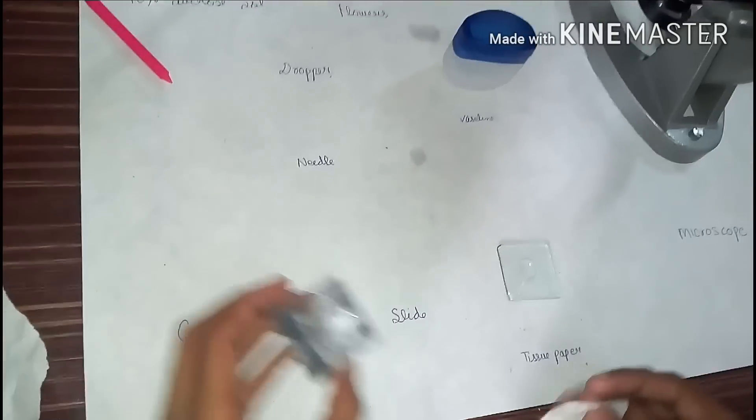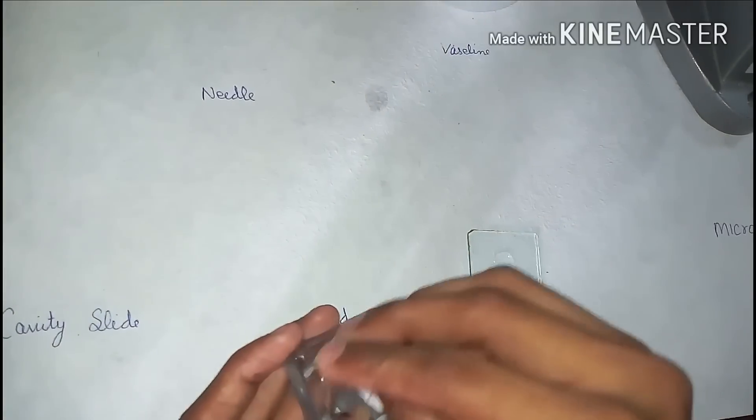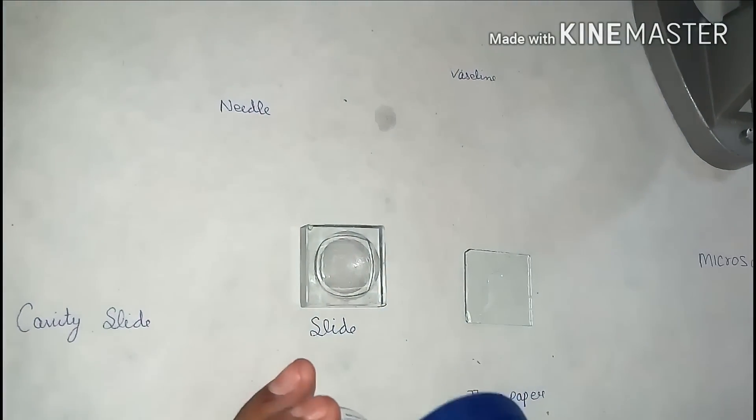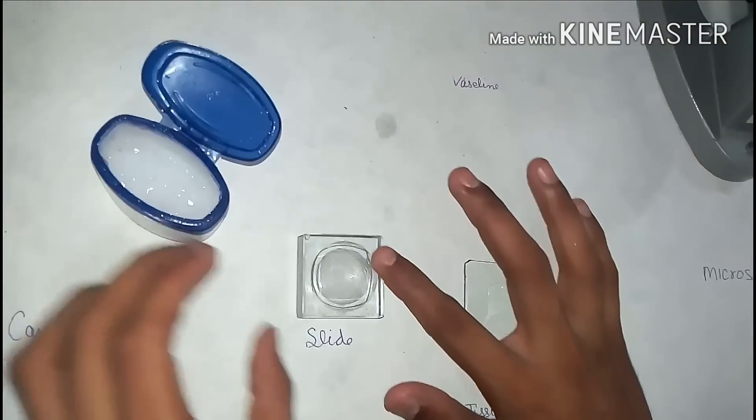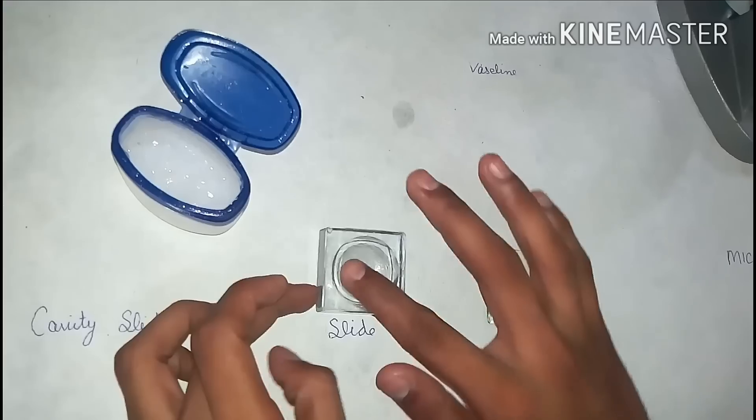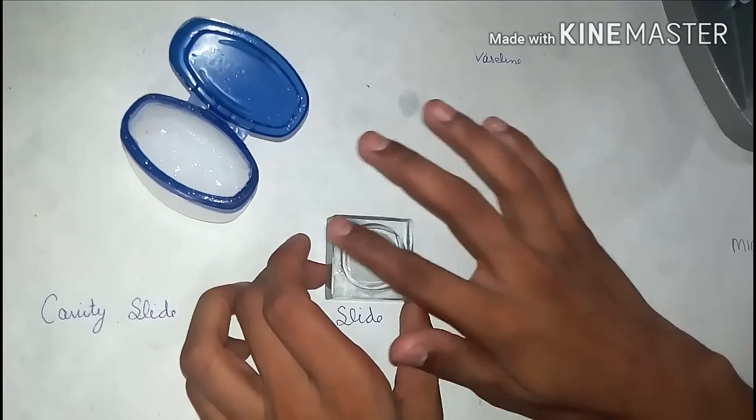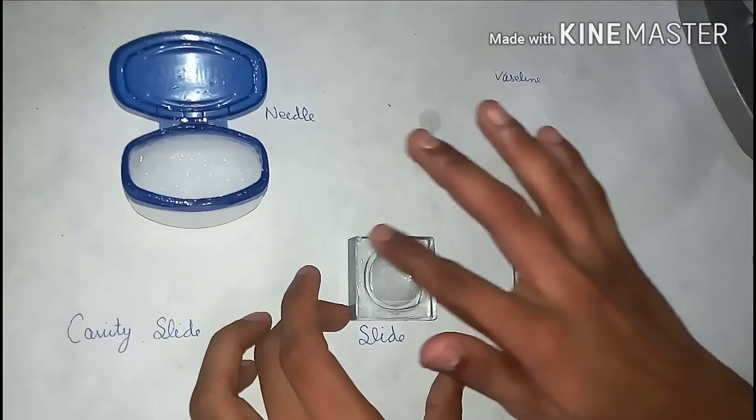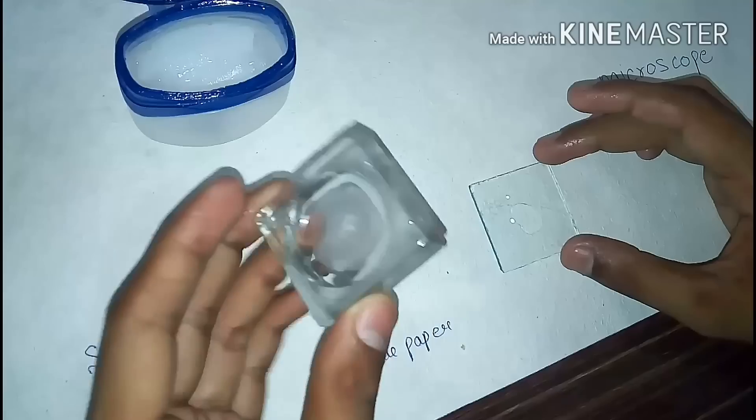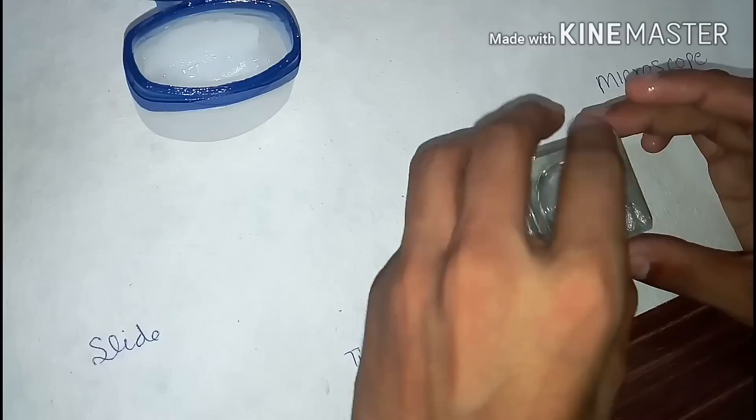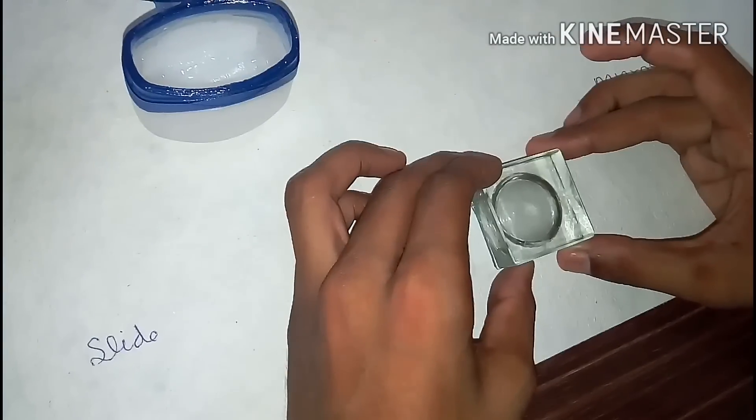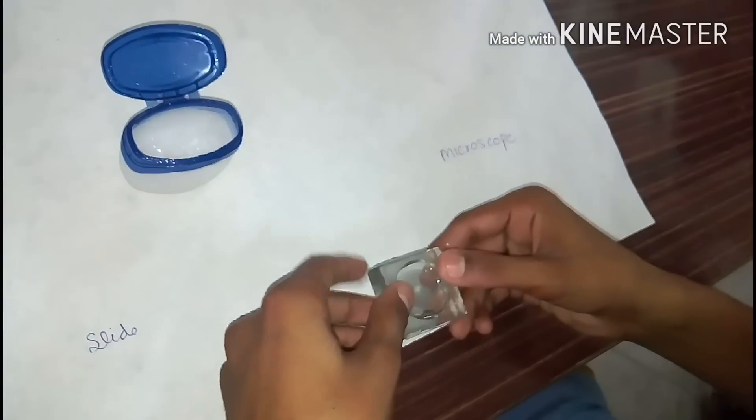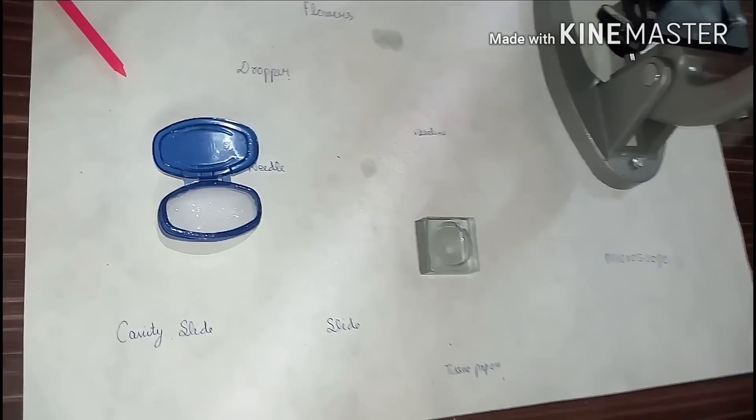Now tear a tissue paper and clean the cavity slide from inside. And apply some vaseline on the edges. Apply it firmly, not in very large amount. We have to just use it to stick the slide on the cavity slide. Just take your cavity slide and put it on the main slide, and finally turn it down. So this is our slide ready.